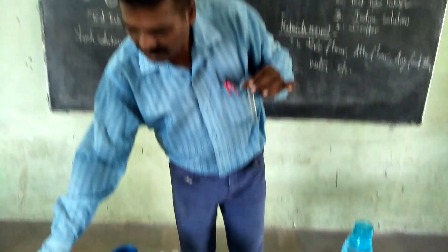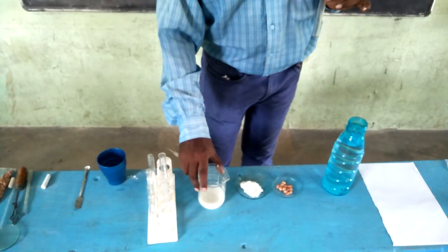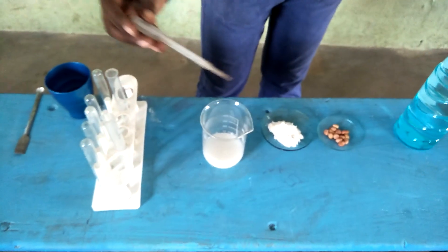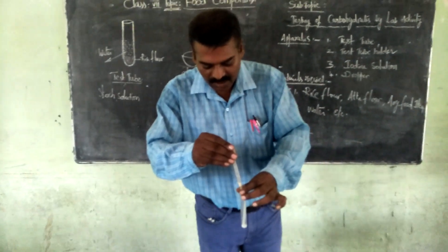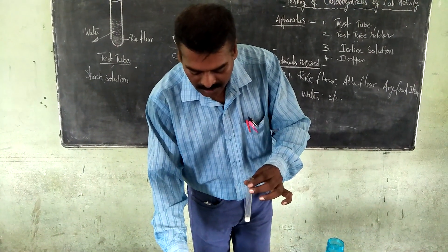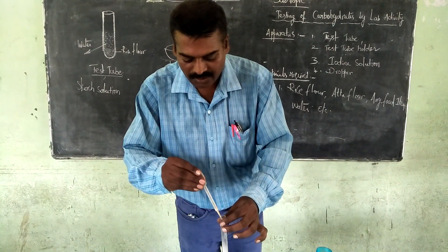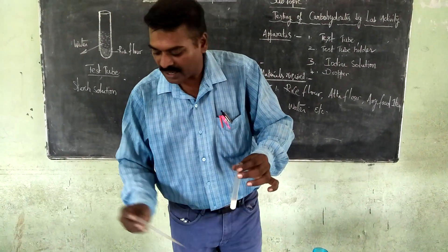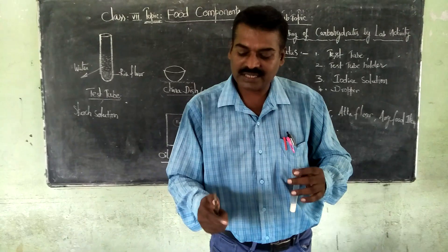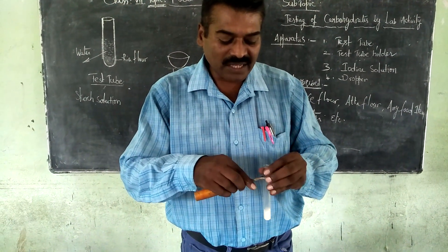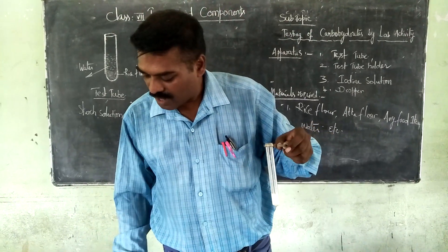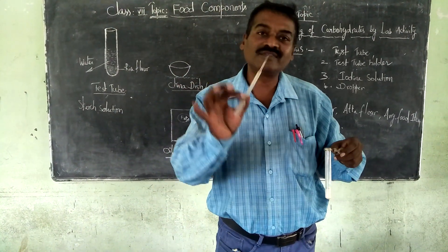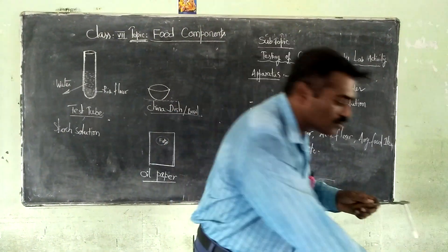Now take one test tube — select a transparent one. With the help of a dropper, take a few ml of the starch solution prepared just now and drop it into the test tube one by one, drop by drop. You can add as much as you want. Use the test tube holder to firmly hold it. That is why it is called a test tube holder. Now take the dropper to add one or two drops of iodine solution.